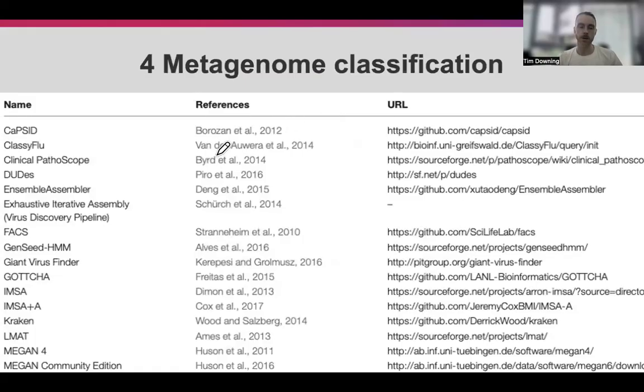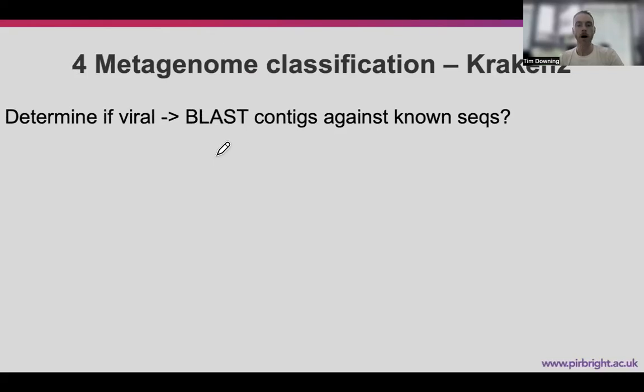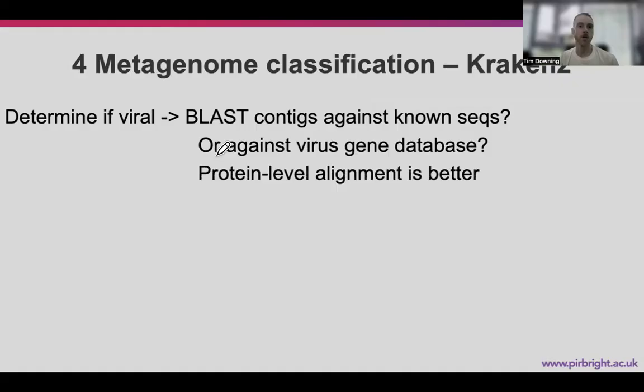There's lots and lots of tools that do this. These ones are a bit old, but you can see there's lots and lots of options. So this just gives you a sense that there's many ways of approaching these different strategies, and we're just using one approach, really, well, two shared approaches, one of which is dependent on Kraken 2. Another thing we can do is use BLAST or other searching approaches to assess our contigs, and that can tell us more about to which organism it belongs.